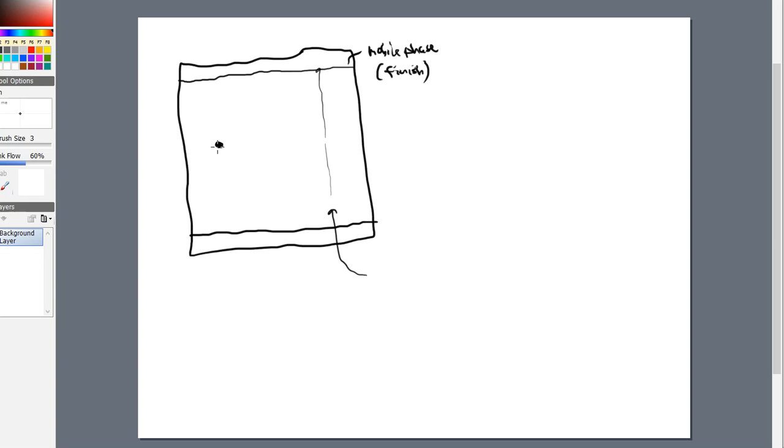I do not want my components to go all the way up here to this finish line, okay? That's not a very good separation. That means they're too soluble in my solvent and my mobile phase, and they travel with my mobile phase, and I guarantee you I will not be able to get good data from that type of plate. So I want my components to lag behind a little bit. So what I would see if I'm spotting, in this case, four different components, I'll see four different spots. They might be different heights, and if so, that's very good. And then I'll have an unknown that will also run and analyze as well.